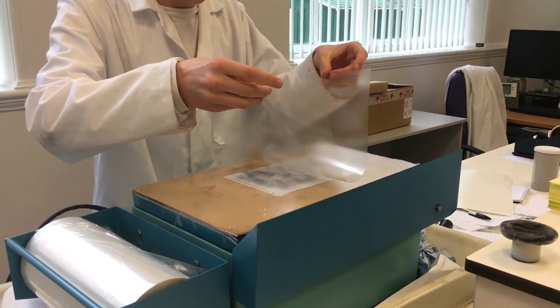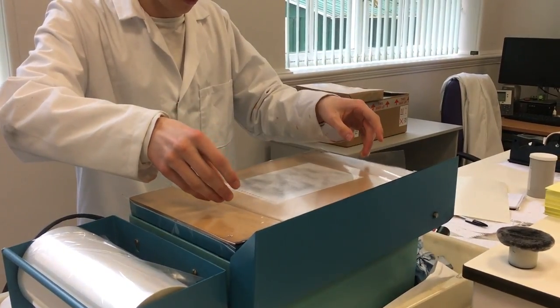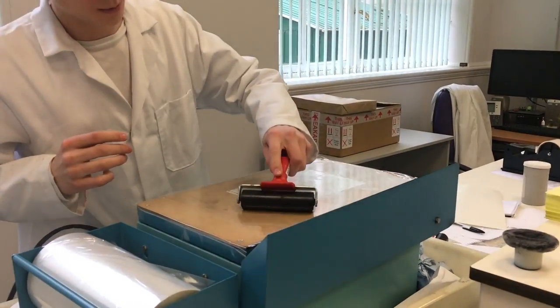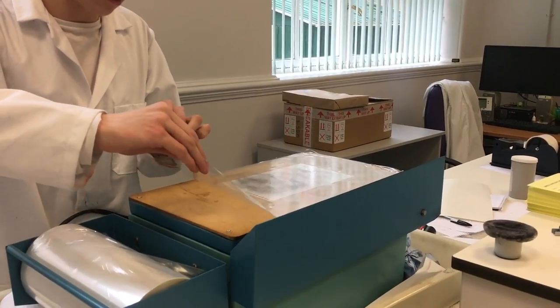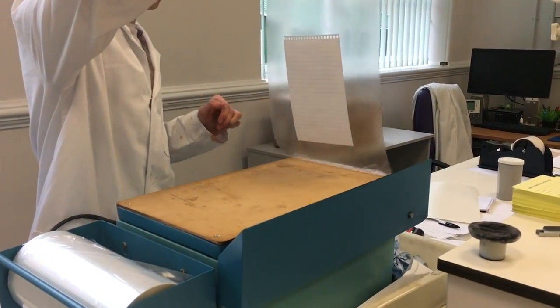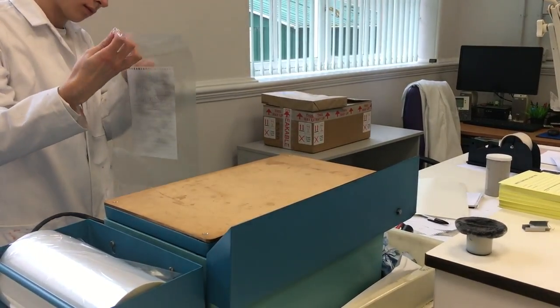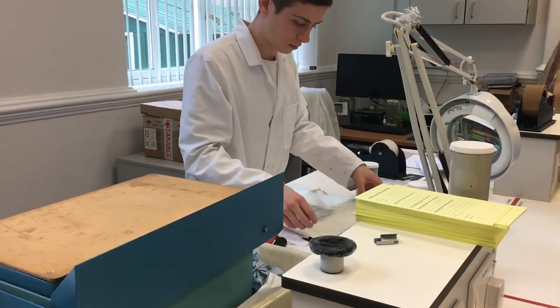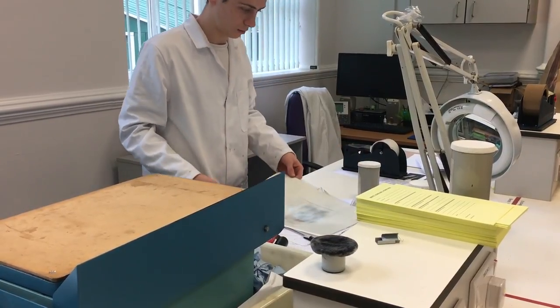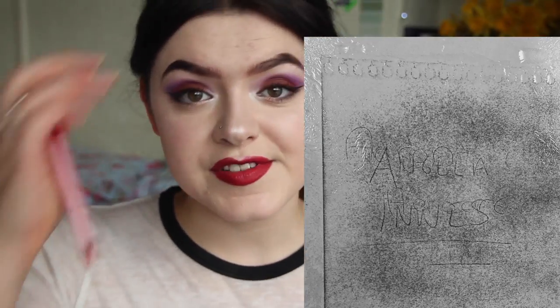A sticky-back plastic sheet is then placed over the film to make the toner permanent rather than temporary dust, creating an image of the writing that could have been on the page. The sheet is smoothed out with a roller to remove any air bubbles. As you could see from the video, the imprints from the handwriting come up after the beads are passed over the top.